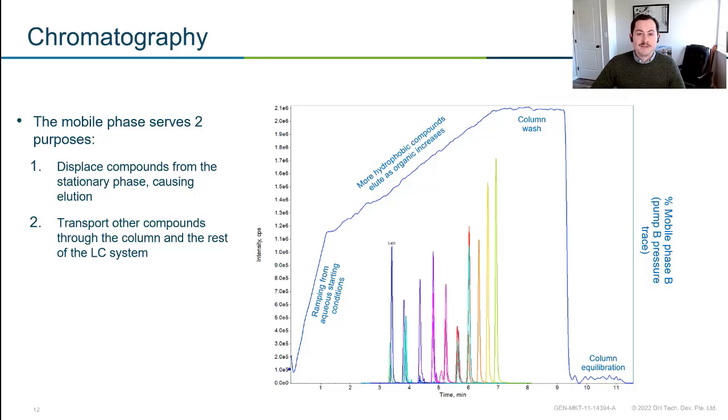And the time it takes to wash off the column is related to that retention in the sense we're thinking about the same variable, how many column volumes it's going to take. So your column volume is related to your column dimensions. So the length, the inner diameter, et cetera. So we want to make sure we get at least 2 to 3 column volumes of organic through our column. And that's just going to ensure that all of those other analytes, the ones we weren't looking for, have washed off our column. We're keeping our column clean, and we can use it for many, many more injections.